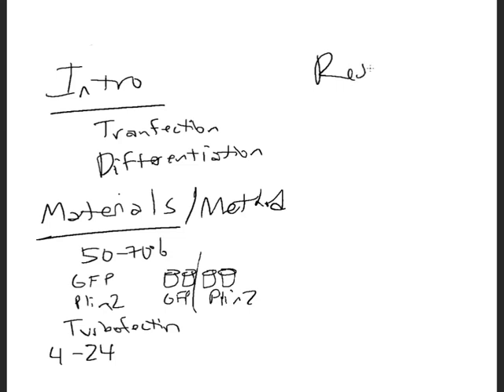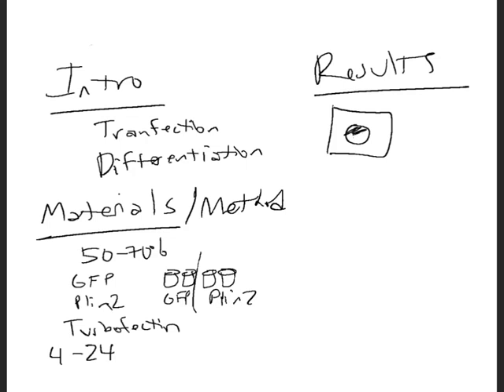Results, these essentially are going to be the pictures. So make sure you look under Files, under Canvas, and I'm going to have a couple of pictures. One will say Control GFP, and it'll show a cell that's just kind of glowing green. The other one will say plin2, and this will actually show that cell with those lipid droplets in it, with the GFP in other areas. They're very distinct from one another. So obviously you'll label them control, and then this is the plin2 plasmid.